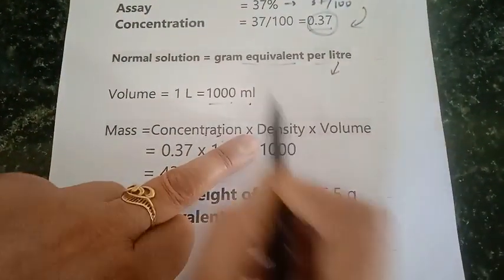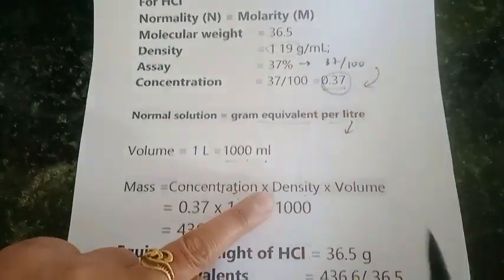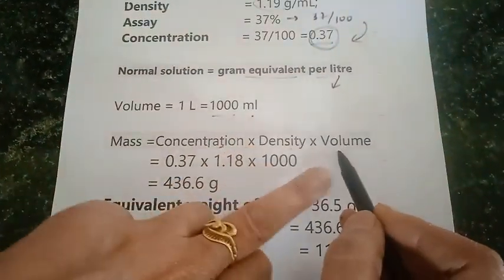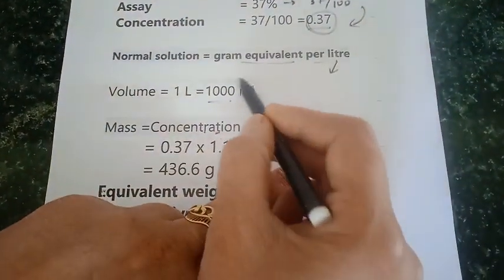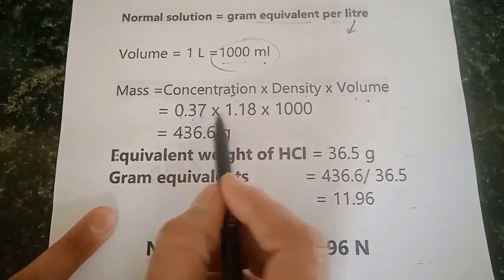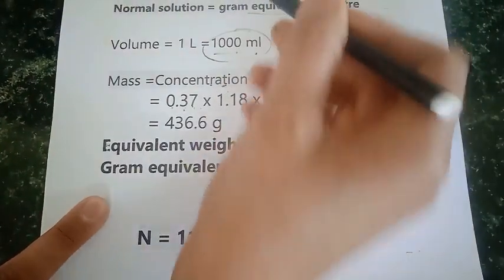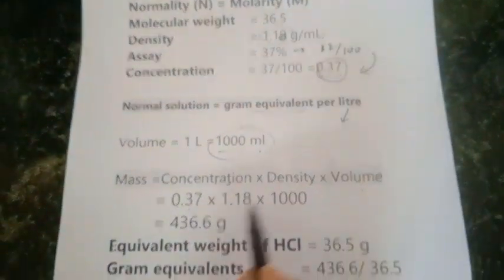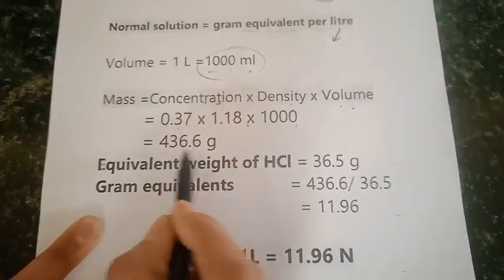So mass is equal to assay into density into volume which we have taken over here. So assay is 0.37 into its density which is 1.18 into the volume of the solution 1000 ml and we get this mass.